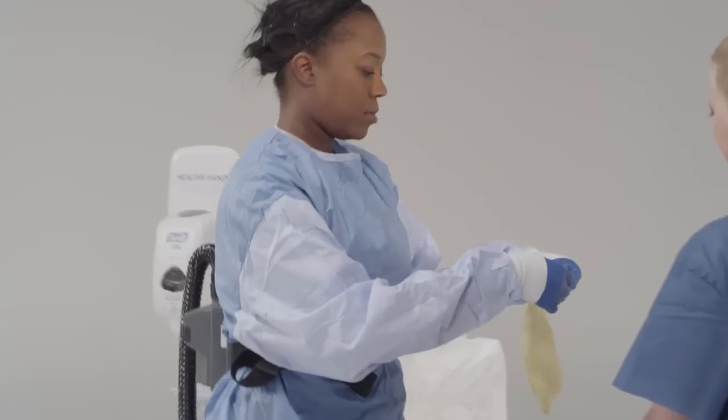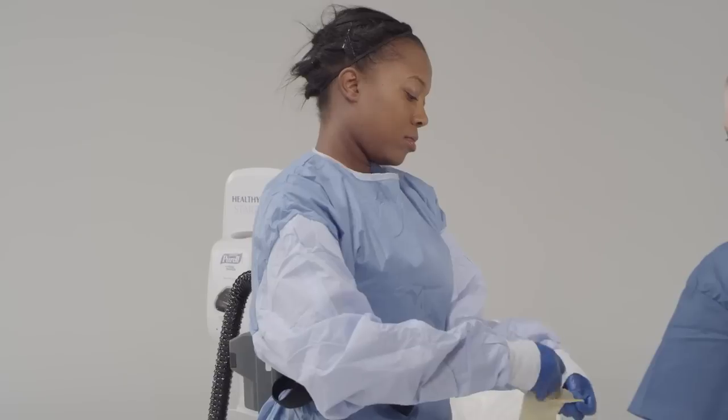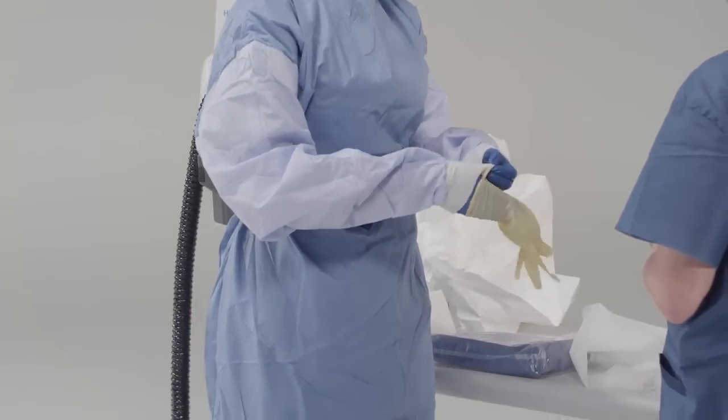Put on the second pair of gloves with extended cuffs. Some facilities may choose to use outer gloves of a different color to easily identify rips or tears. Ensure the cuffs are pulled up and over the sleeves of the gown.